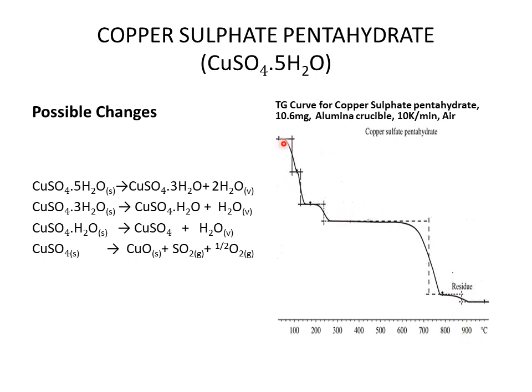One thing must be noted over here. If the temperature is increased very rapidly, the events can merge into each other. So these events can be better resolved from each other if we increase the temperature slowly. You can see here the depressions are quite resolved from each other. Here is the first depression, then the second, then the third, and here is the fourth depression, meaning loss in mass with increase in temperature.